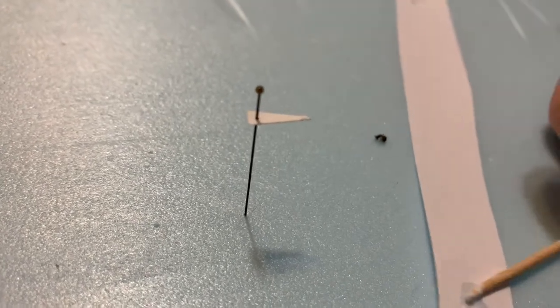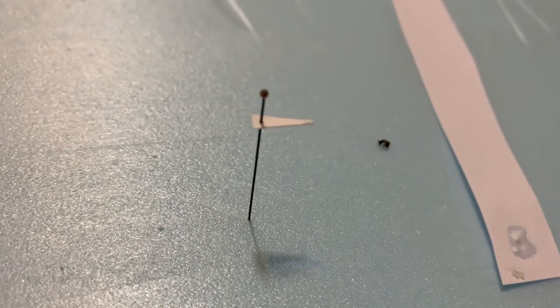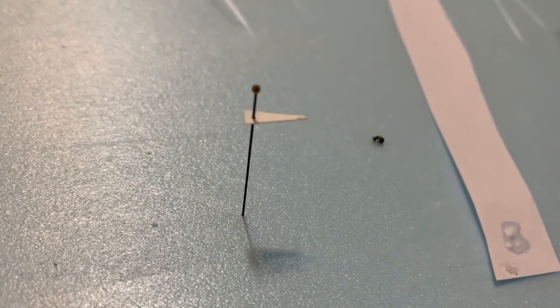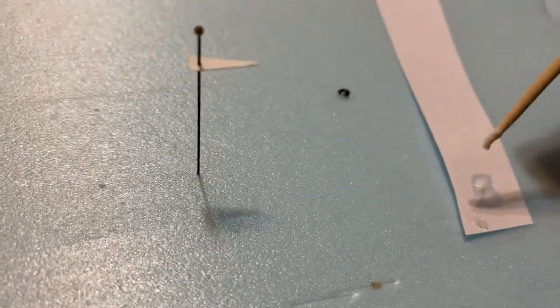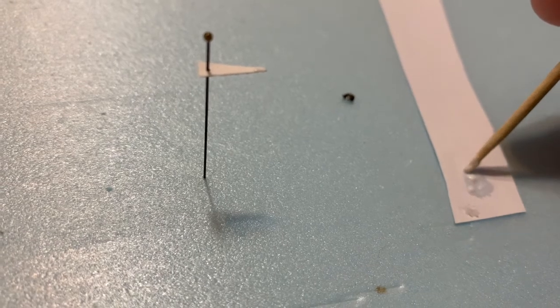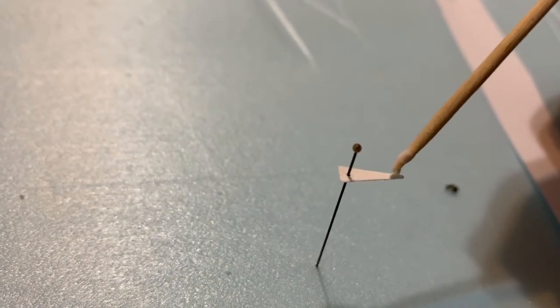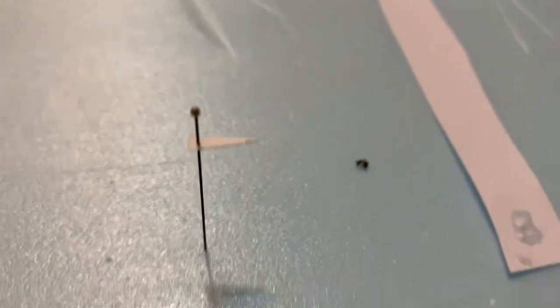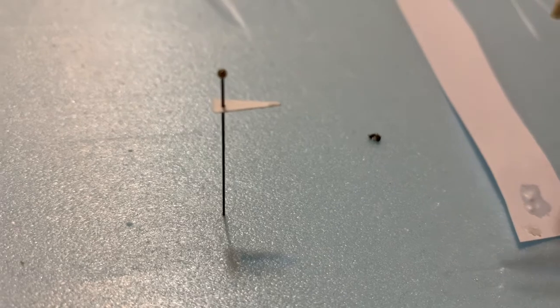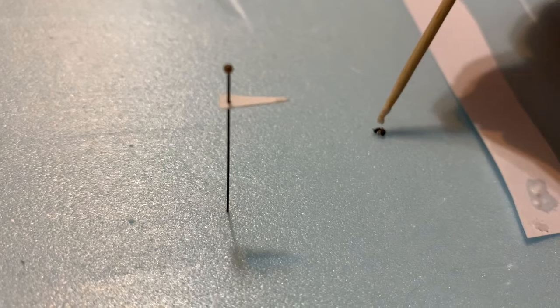Okay, so we're going to take our toothpick or our pin, whatever we're using, to put the glue on the point. We're just going to take the tiniest little bit of white school glue, just a dab on the end. Once you've done that, you just dab a tiny bit onto your point here. You don't want an excessive amount, and we're doing this at the very end of the point, out at the pointy end.